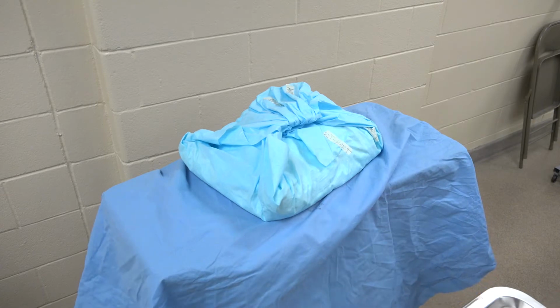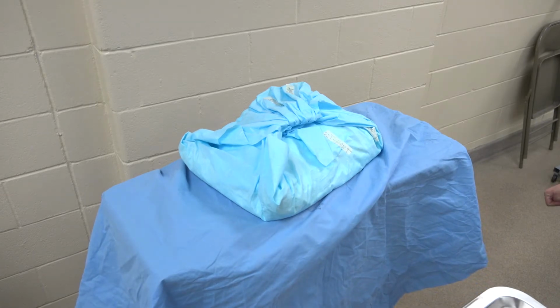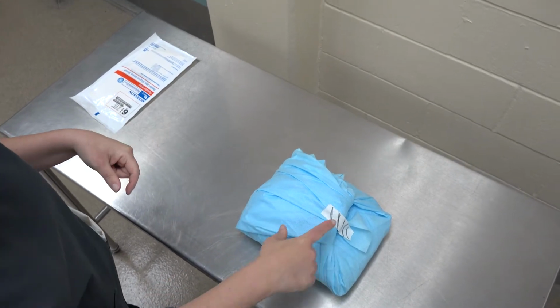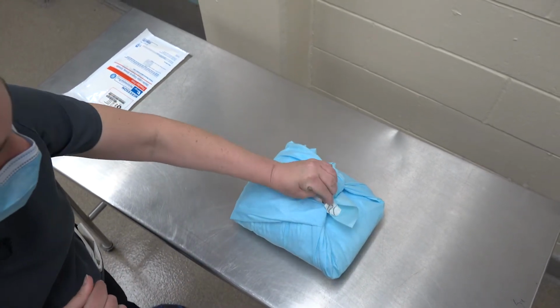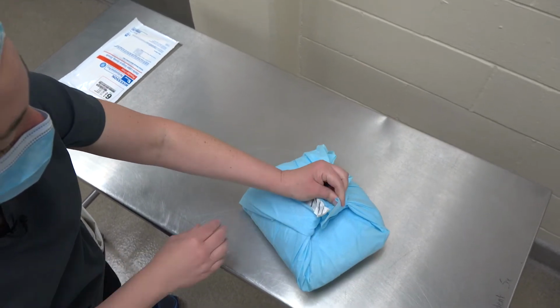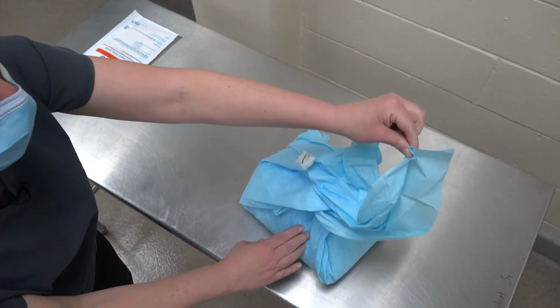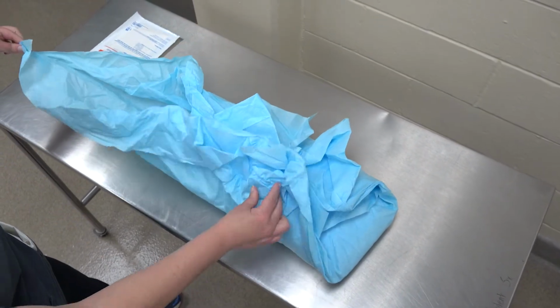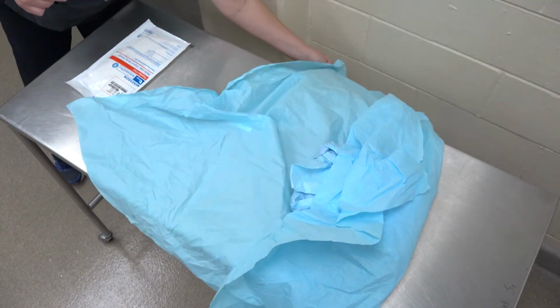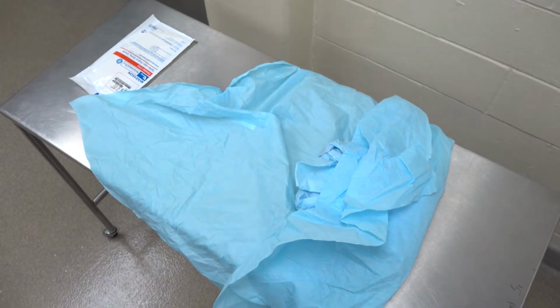All right, now it's time to go get the gowns ready. Okay guys, now we're on to the gown pack. So again, I'm looking to make sure it's sterile, and then I'm going to keep my fingers on the outside because again, my fingers are not sterile. So I got to catch this, and this is packed tightly, which is good. So I'm going to open it so that all of my hands are on the outside again, as much as possible.